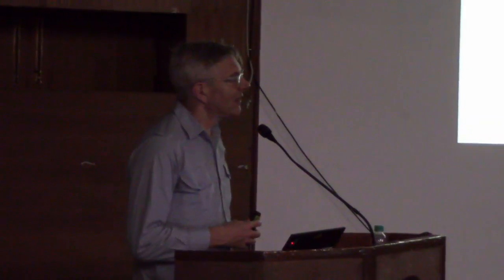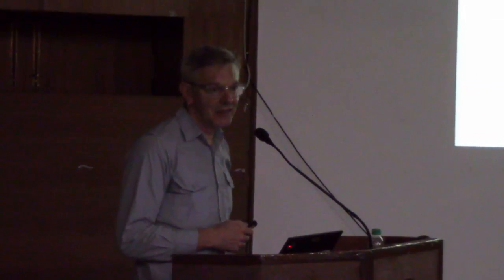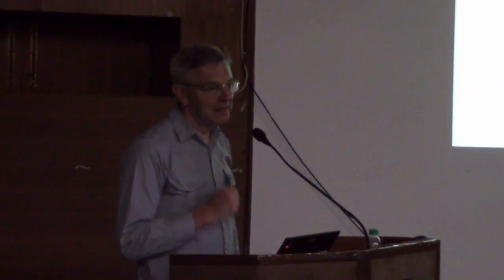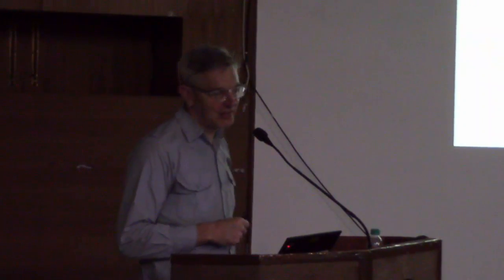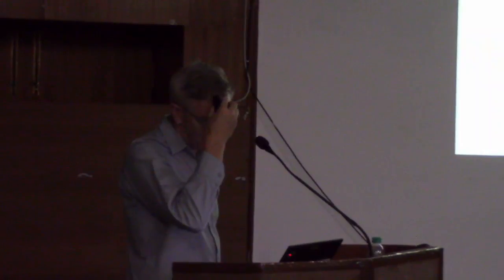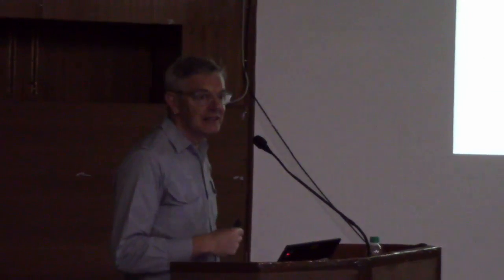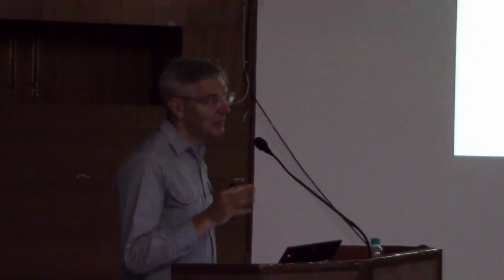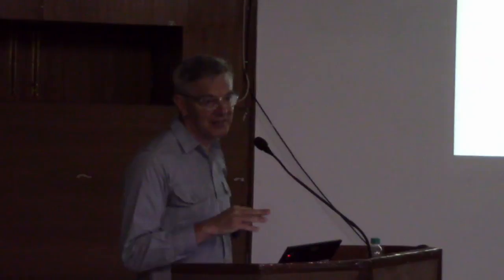I mean, I think that the ceramic ones are easy, they're less fragile, that's all. They cost a bit more. But it doesn't affect the performance as far as I understand. The thing that affects the performance is what kind of focus you get, if you get a micro focus or a line focus. And I'm not super expert on that, so it's best to work with the manufacturers to figure out what's best.